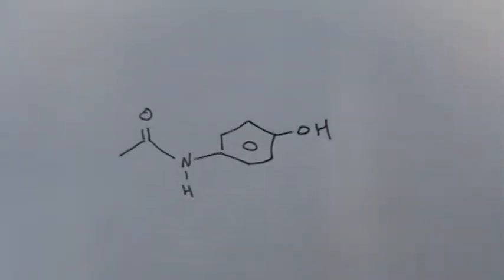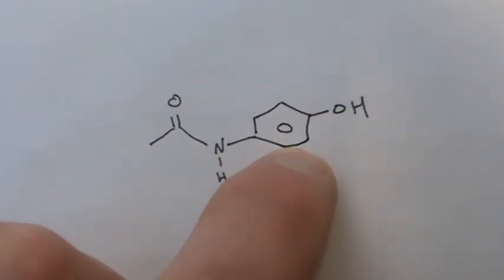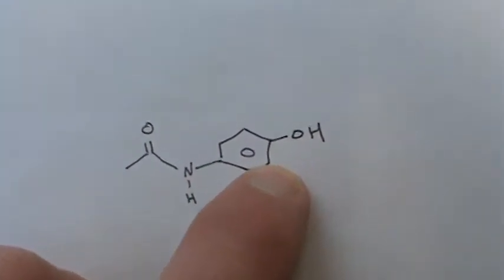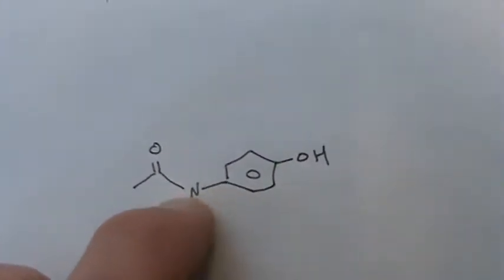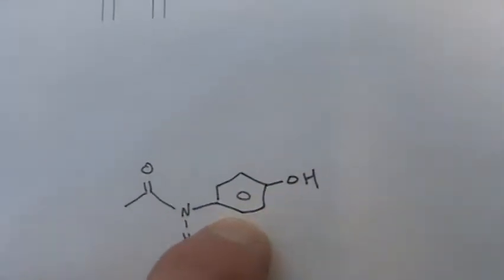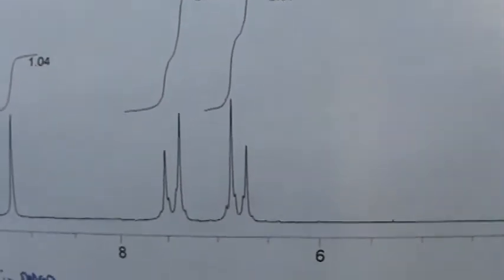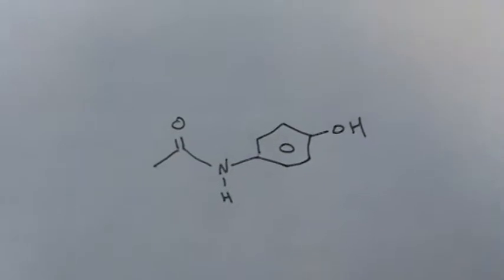If we look at the proton of that same compound, obviously then the classic para-substituted pattern: the two hydrogens ortho to the OH will give one peak, which looks next door, sees one, so that'll be a doublet. The two H's ortho to the amide will talk to that one type, and give a doublet. So you see two doublets, which is the classic para-substituted pattern. Exactly which doublet belongs to which side, I'm not 100% sure. You'd have to have a reference material for that.